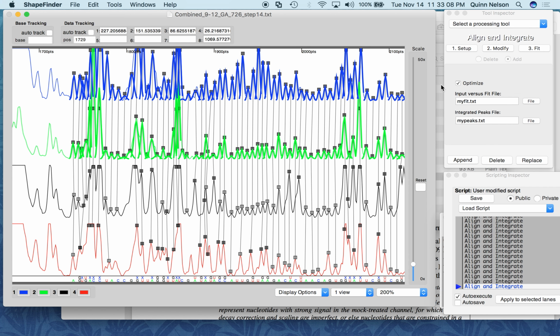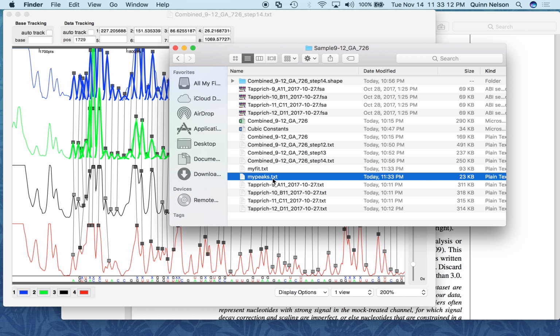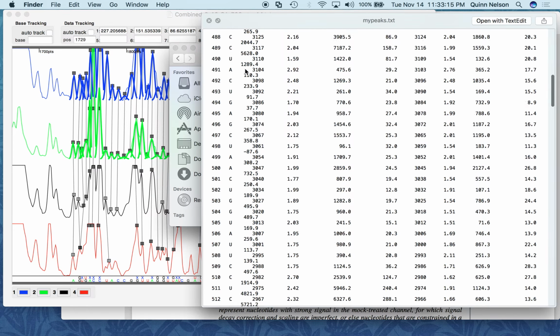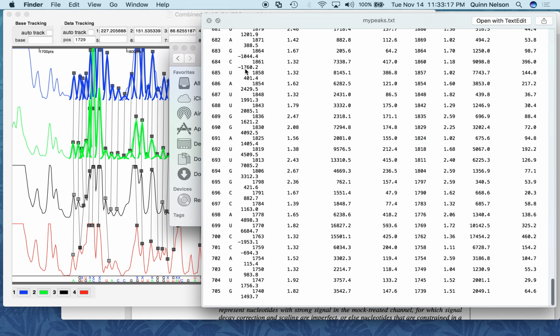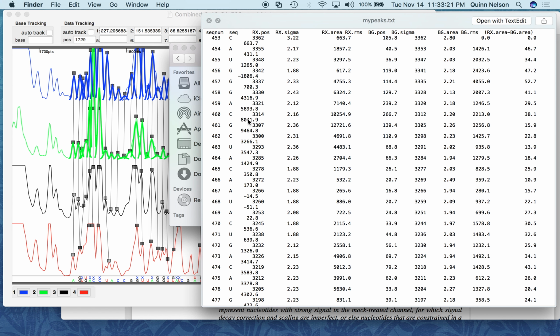Okay, it is done. We're doing this live time. This is live TV, guys. 11:33, and so this changed. This is interesting. I gave it a larger window. This is like live bioinformatics. I couldn't be more excited about it, guys.